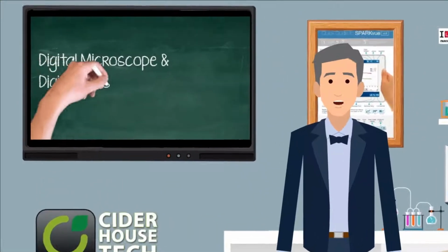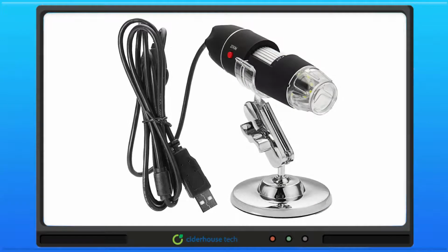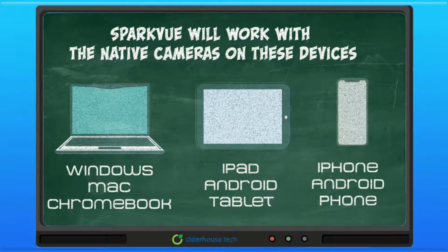Digital microscopes and digital presentation. In this demonstration, a standalone digital microscope is used. The procedure is exactly the same for a digital eyepiece camera. This function is also the same for the camera on your laptop, tablet or smartphone.